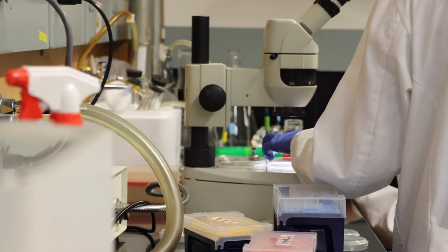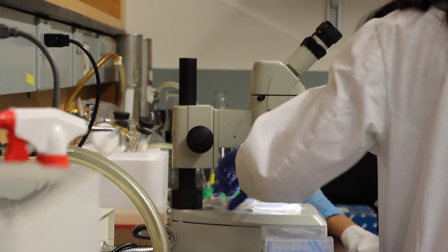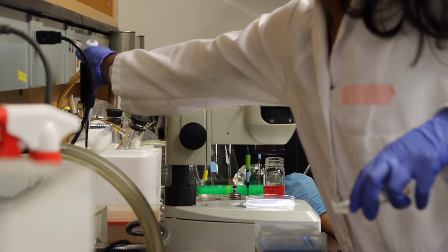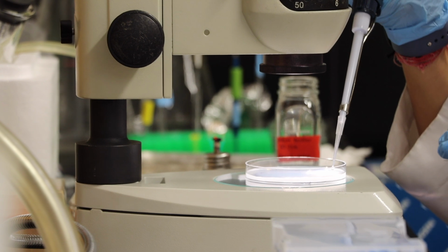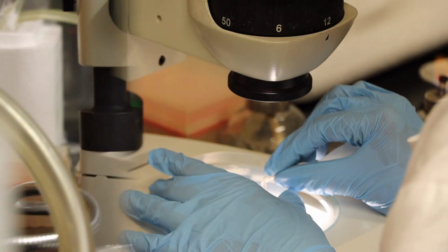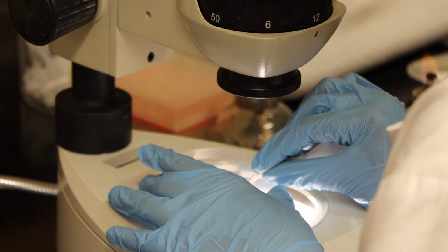Next, the 2 control assays will be performed. In one control, the worms are exposed to the odor in the training stage but will not be zapped. The purpose of this control is to confirm that the worms will still find the odor attractive, even when they go through obstacles and adaptations such as the worm trap and through the training period.